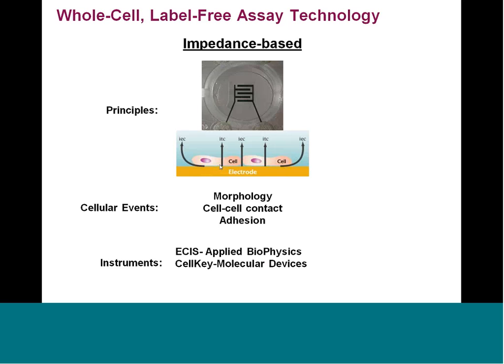And those frequencies span 6 orders of magnitude, so a tremendous breadth in frequency. And all of that data is then transformed into a single trace, a single output that does something really stunning. It can detect GPCR signaling, whether it be through Gi-coupled receptors, Gq, or Gs. And that's pretty stunning in and of itself.